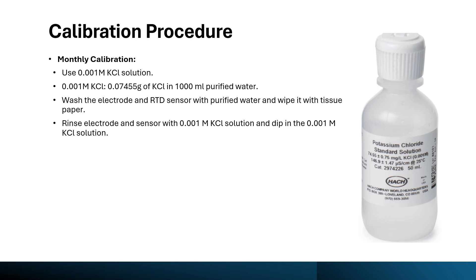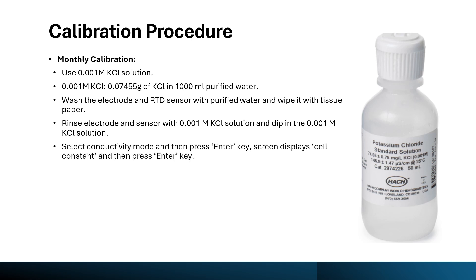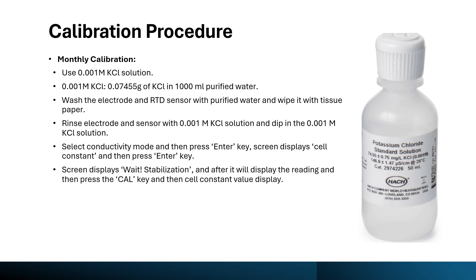Dip the electrode into the KCl solution. Select the conductivity mode and press the enter key on your conductivity meter display. The screen will display the cell constant — when the cell constant screen appears, press the enter key. After pressing enter, the screen displays stabilization and then shows the reading. Press the cal key, which will display the cell constant value. Once the cell constant value is displayed, press the enter key and type the cell constant value as 0.1.